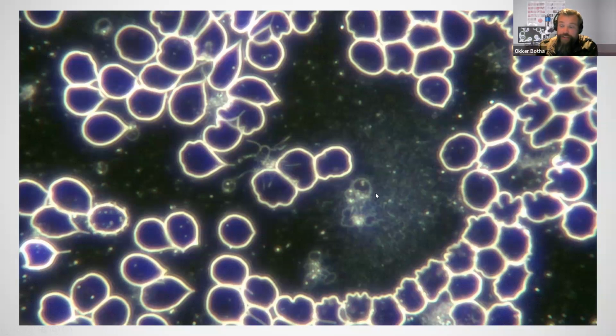The sort of grayish pattern towards the right hand side is also fibrin, also related to liver stress, but an earlier stage of liver stress before we get thick and interconnected white lines. We get this type of hazy pattern, and this is even more difficult to see than those thick established lines.